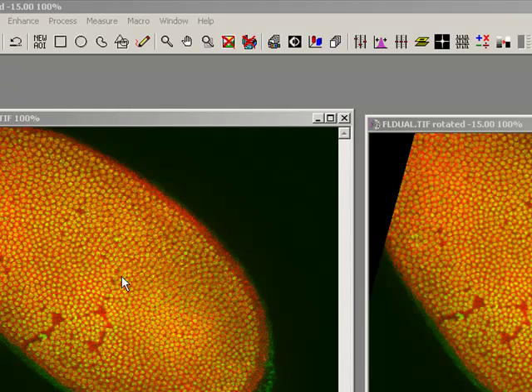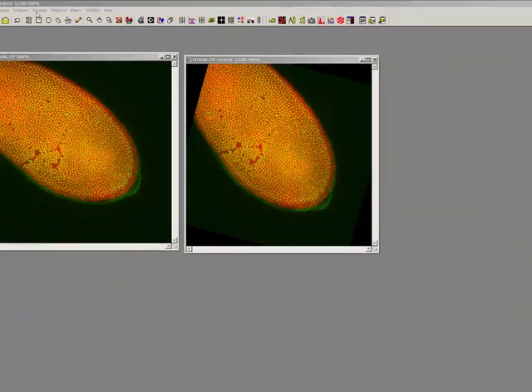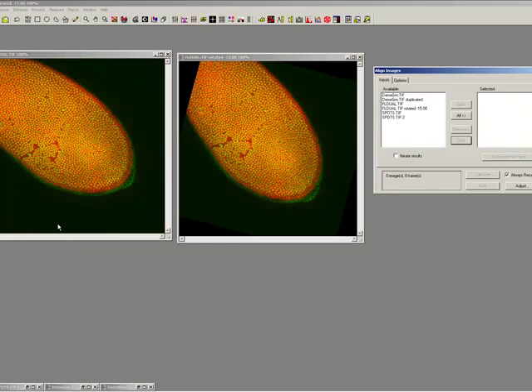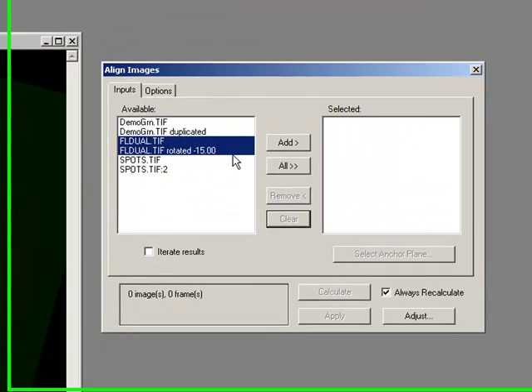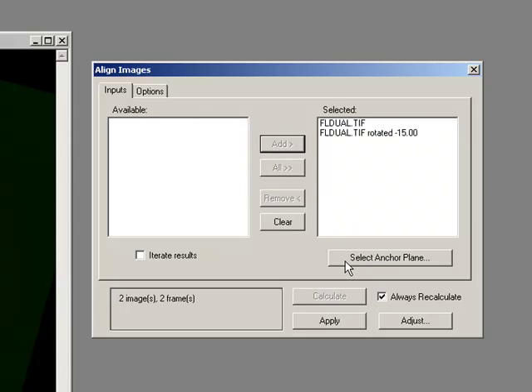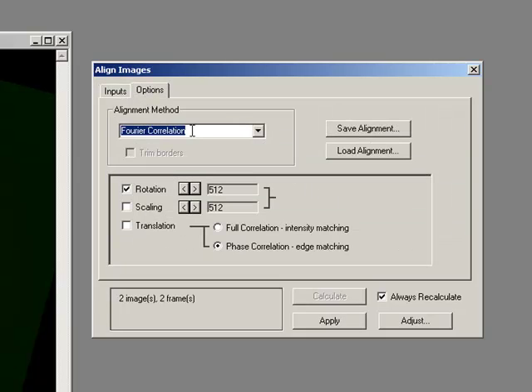What I'm going to do is just align them so I get a single movie file which has got both images that overlap on top of each other. To do that I just go process, align images and I just pick the two images and bring them across to this side here. And then I say okay I want to do a Fourier correlation and because my problem here is rotation I'm just going to select rotation.